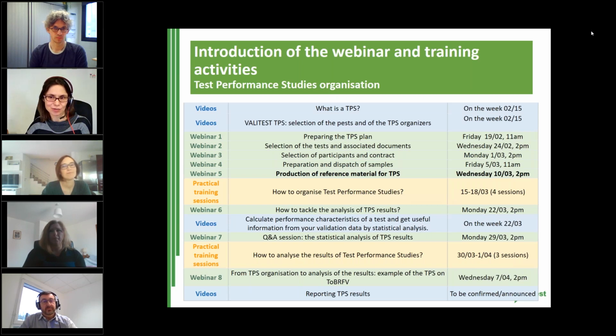Okay, and there is another question regarding LOA. Is it possible to arrange it yearly to avoid the problem of not having it in time when needed? I think this depends on the country, on the National Plant Protection Organization, how they would like to do this. In our case, currently this is not possible. We need to ask for each study separately to clearly specify the number of samples we will get and the time when we'll perform the analysis. But I guess this may be different in different countries.